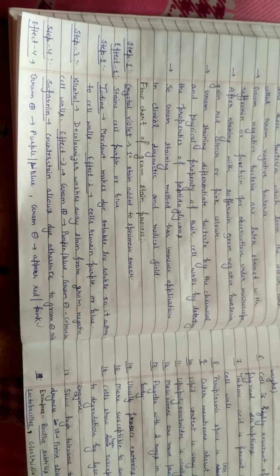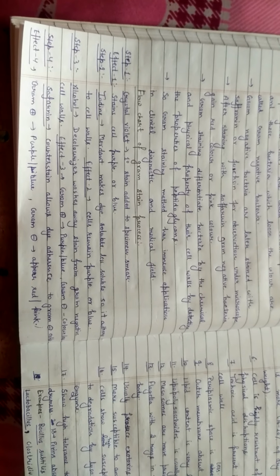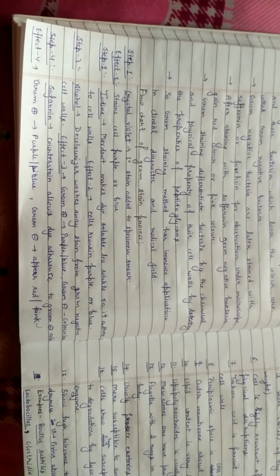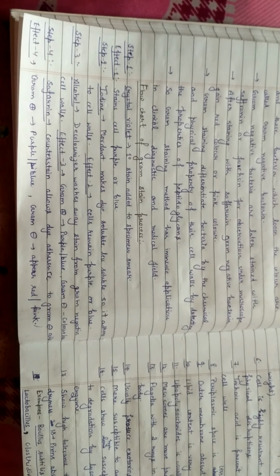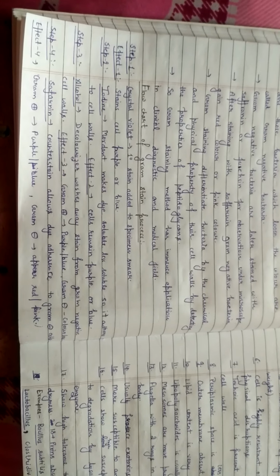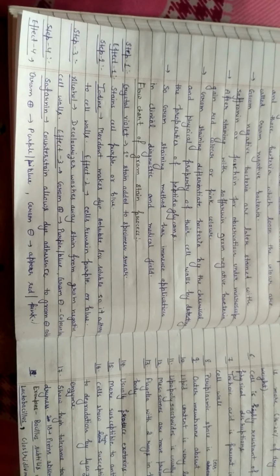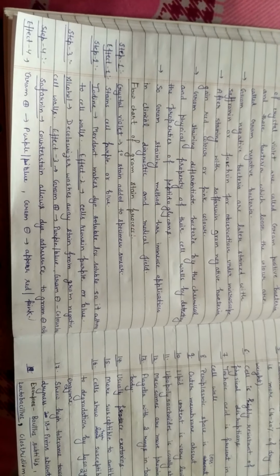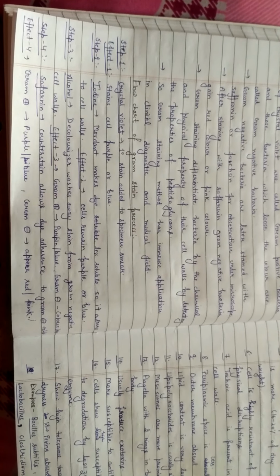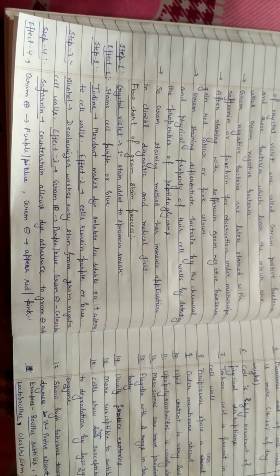But here is the differentiation between gram-positive and gram-negative. Gram-positive bacteria have a cell wall made up of peptidoglycan, because more peptidoglycan is present in gram-positive bacteria. That's why after treatment with alcohol, the purplish or bluish color due to crystal violet dye is not washed away.